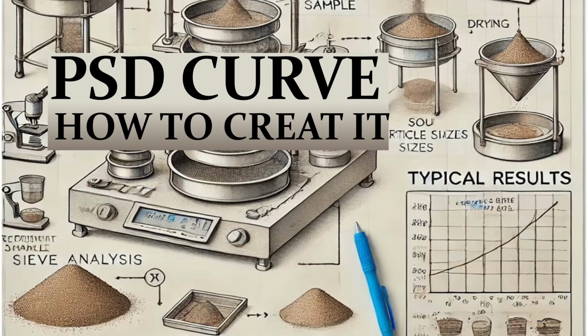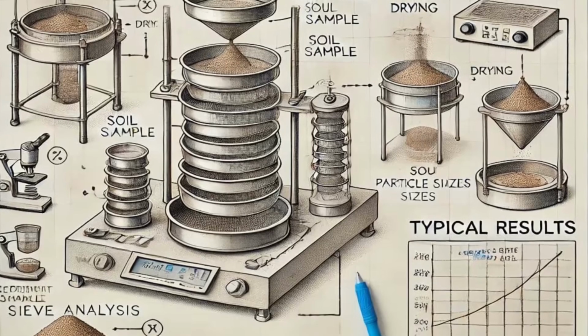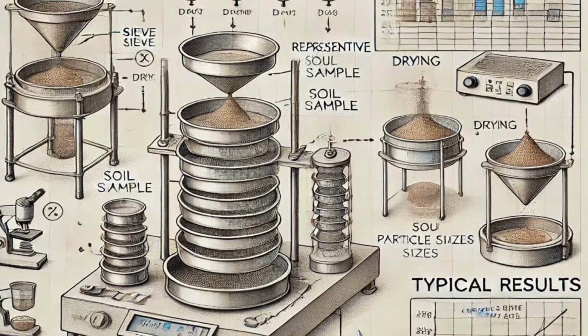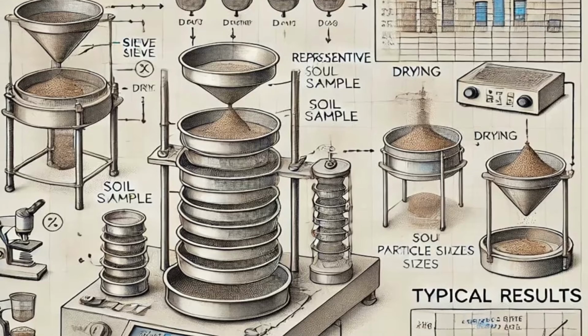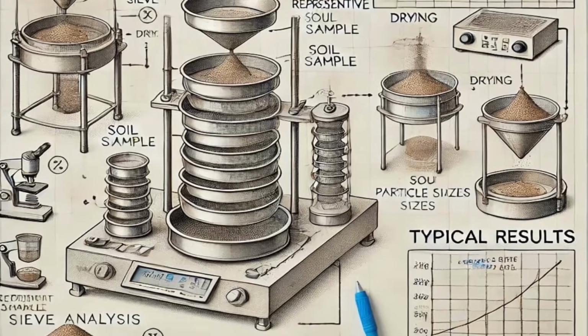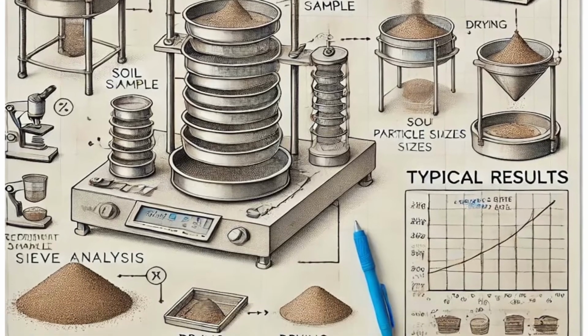Particle size distribution curve. What is it? How do you build one? And why? What can it tell you about your material, your sample, about the environment it was created in, and why people do that? In this video, we talk about the particle size distribution curve, how to build it, the kind of analysis you can do with it, and what it can tell you just from looking at this curve, what is the main average size distribution of your material.